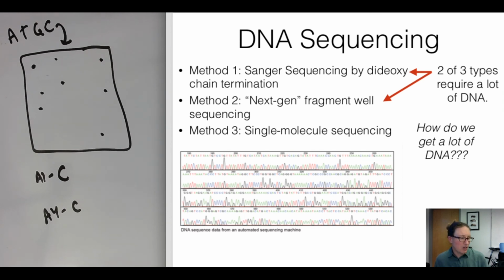Okay, so here I've taken you through a tour of DNA sequencing methods, from old school Sanger sequencing, how the whole process got started, through to next generation sequencing, which is still one of the predominant methods of sequencing that's used, up to single molecule sequencing, which has really taken off and again expanded our ability to sequence all kinds of genomes.